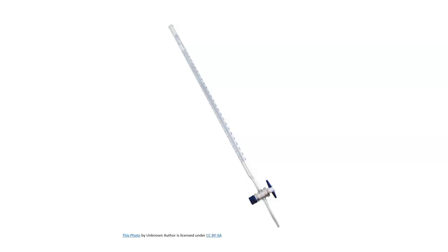Basically, what we're going to do is after you release all that water, and you can do that in the sink, you're going to close the stopcock, and you're just going to put about 5 or 10 milliliters of the titrant, which is what's going to be used through the burette. You're going to put just 5 to 10 milliliters in there. You don't have to measure it. Just put some in there. You're using it to condition.